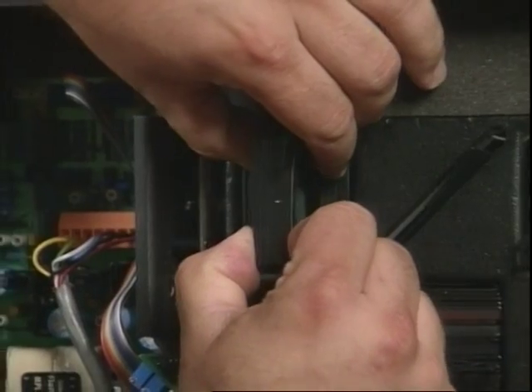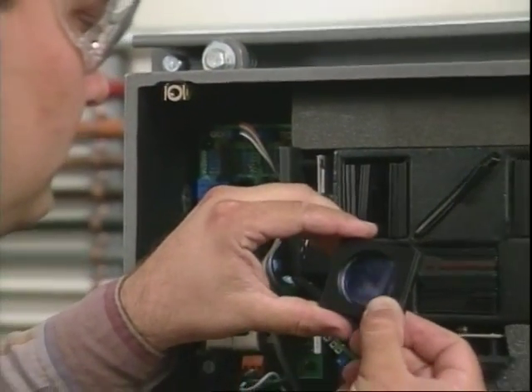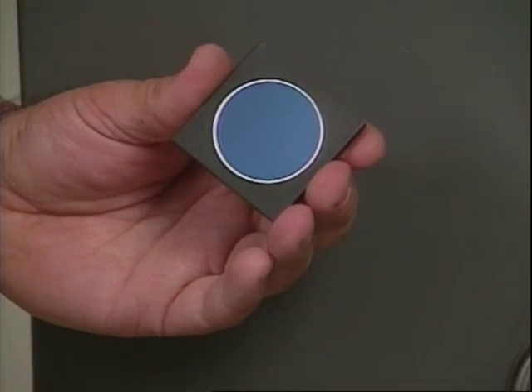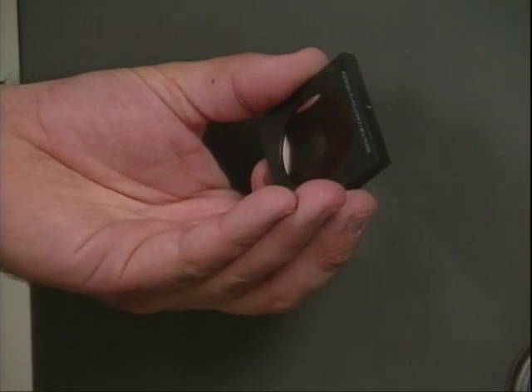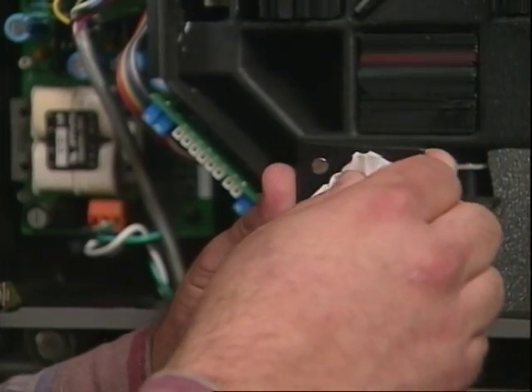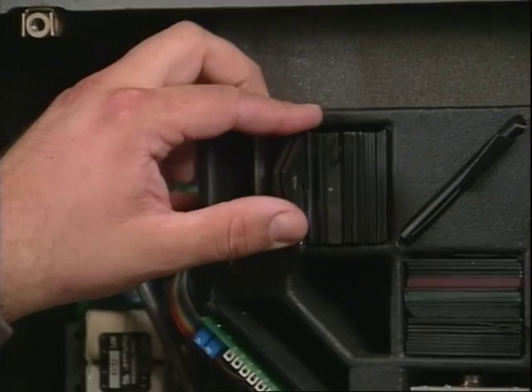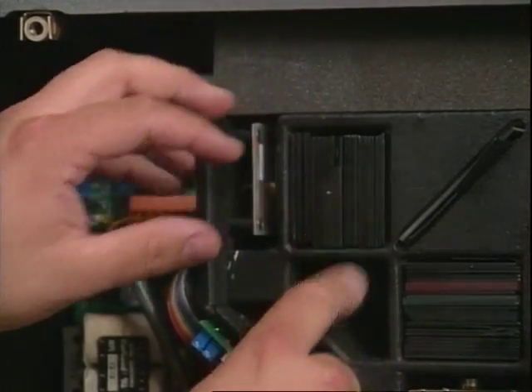Spectroscopic analyzer filters usually require very little maintenance because they filter only light. No process components come into contact with them. Be sure the filters are clean following maintenance of other analyzer elements. Avoid getting the mirrors and lenses dirty. When the analyzer cover is removed for maintenance, check for dust, fingerprints, or excess cleaning solution. Clean the lenses as necessary.